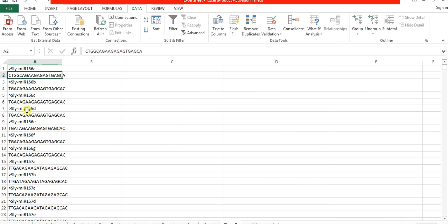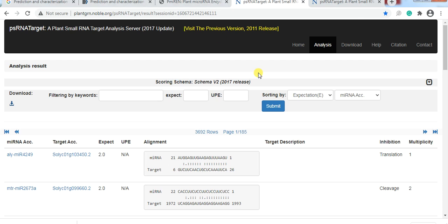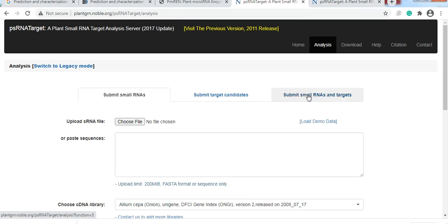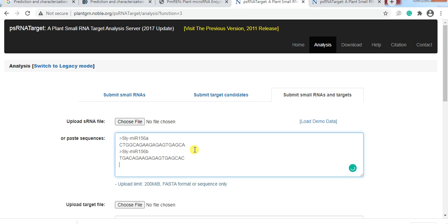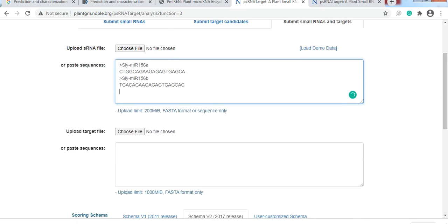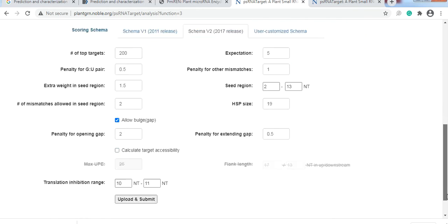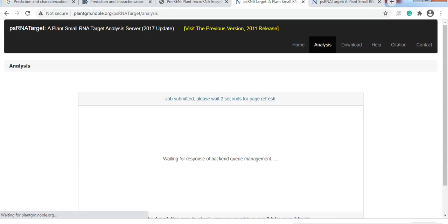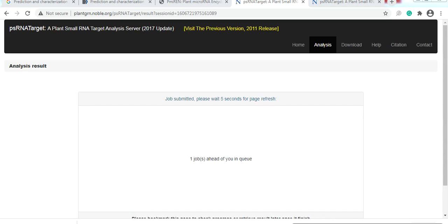If you want to know whether these two specific microRNAs target your gene or not, copy only those two microRNA sequences. Then open psRNATarget and use 'Submit Small RNA and Target' — paste only those two microRNA sequences and paste the sequence of your gene, then Upload and Submit. In this way, you will know if those specific microRNAs target your gene family.